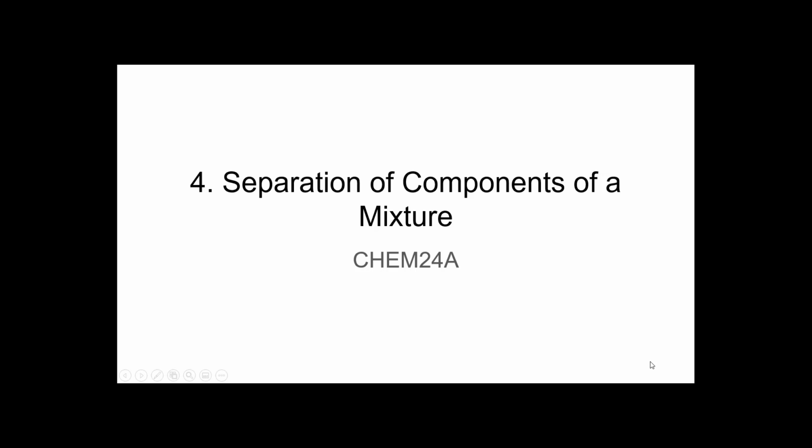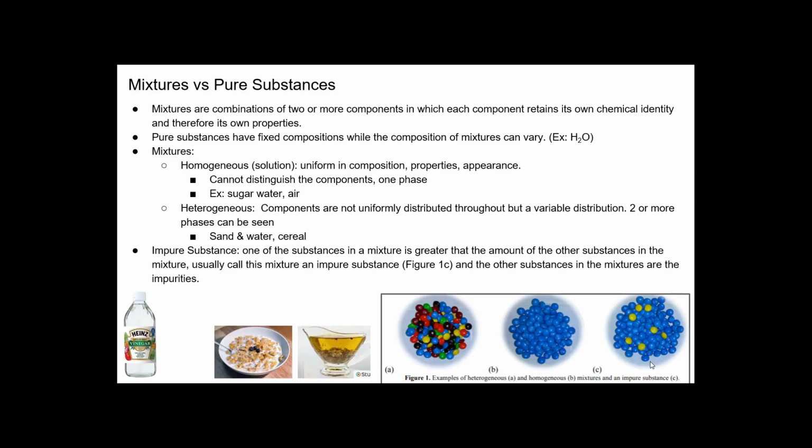Hi class, this week our lab is separation of components of a mixture. Mixtures are combinations of two or more components. In this case, LabFlow refers to substances as components. They mean the same thing, but I am going to refer to everything as components. That's how LabFlow wants it.